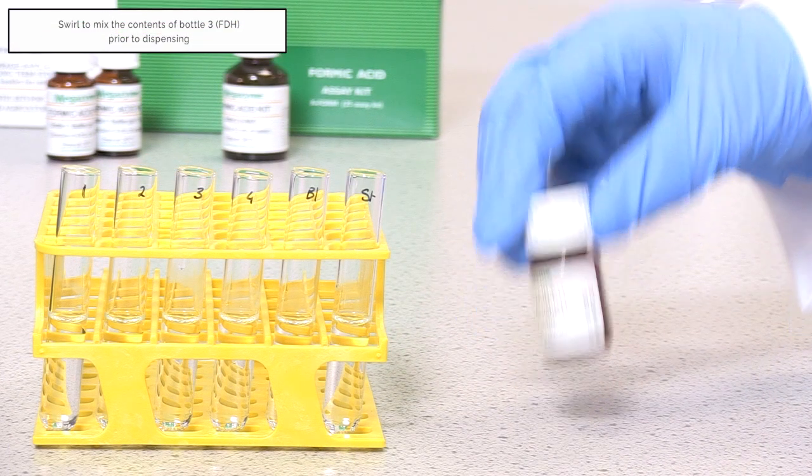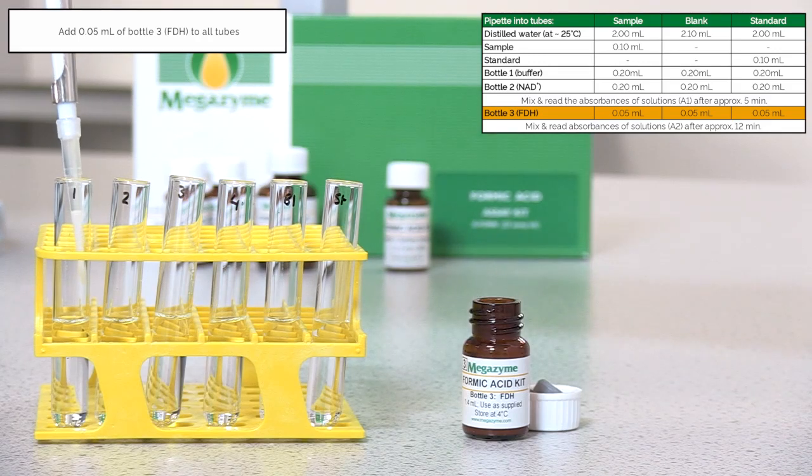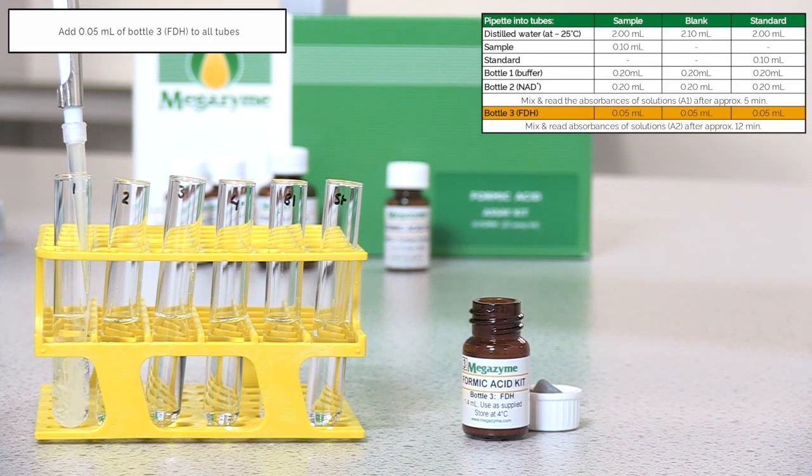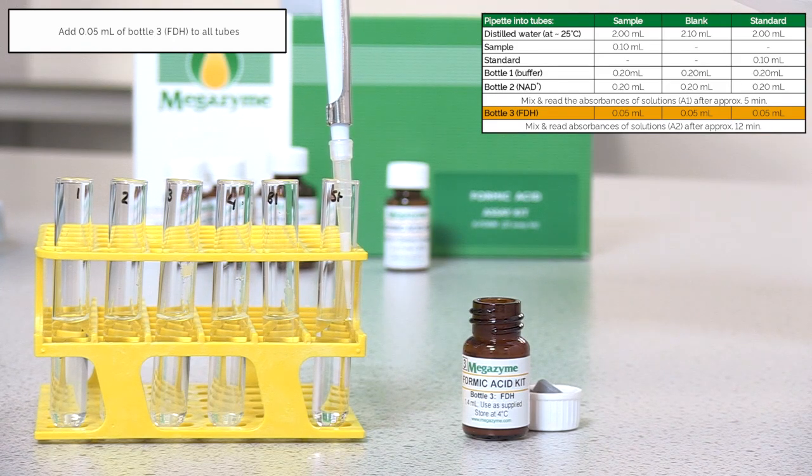Swirl to mix the contents of Bottle 3 formate dehydrogenase prior to dispensing. After recording the A1 absorbance value, pipette 0.05 ml of Bottle 3 into all assay tubes.